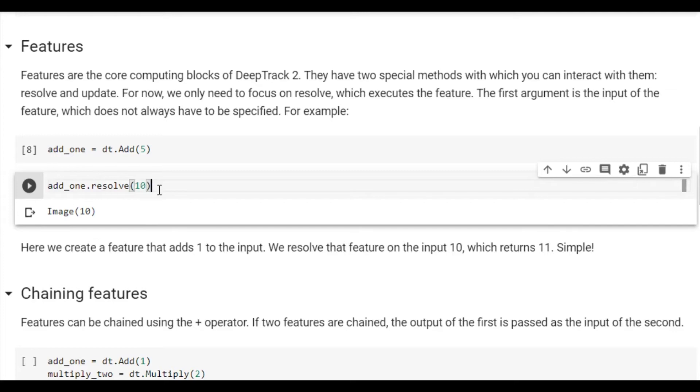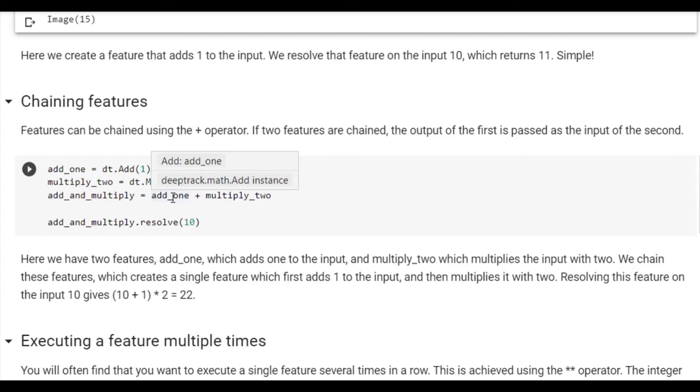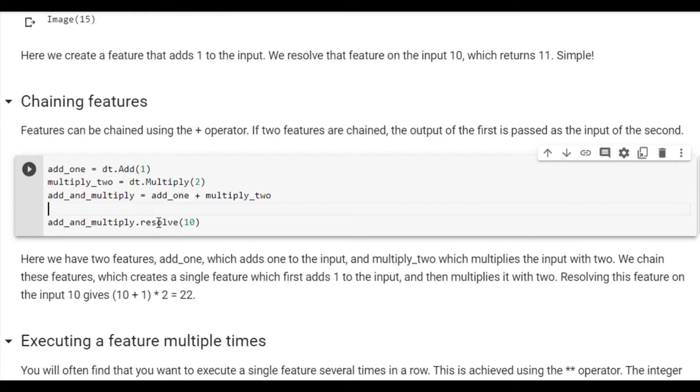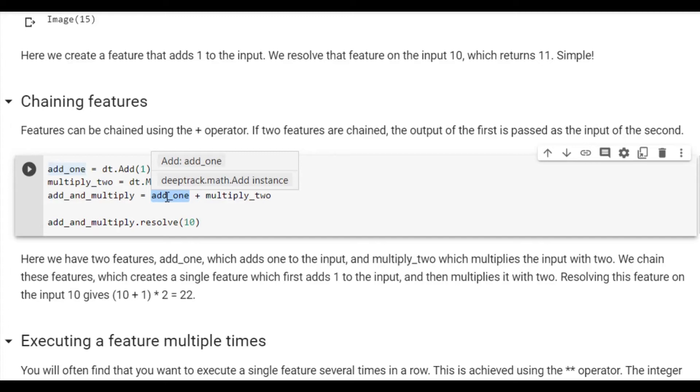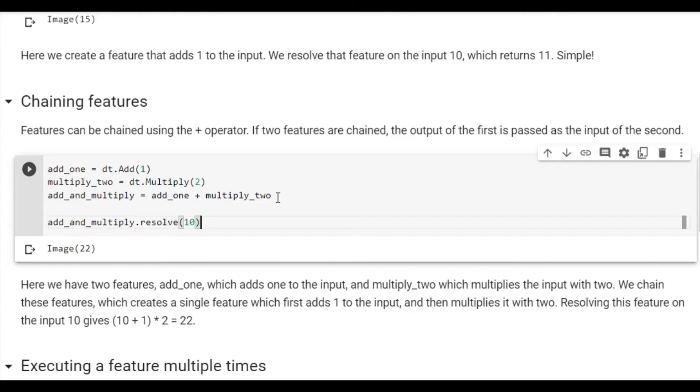We can also execute two features in sequence using the plus operator. This means that the output of the first feature will be sent as the input of the second feature. For example, here we have one feature which adds the value of 1, and a second feature which multiplies by 2. We can then combine these features into a single feature using the plus operator. This means that whatever input we pass will first have one added to it, and the result of that will be multiplied by 2. So for example, if we resolve this on the input 10, we get 22, because 10 plus 1 is 11, and 11 times 2 is 22. Similarly, if we change it to instead add 5, we get 30, because 10 plus 5 is 15, and 15 times 2 is 30.